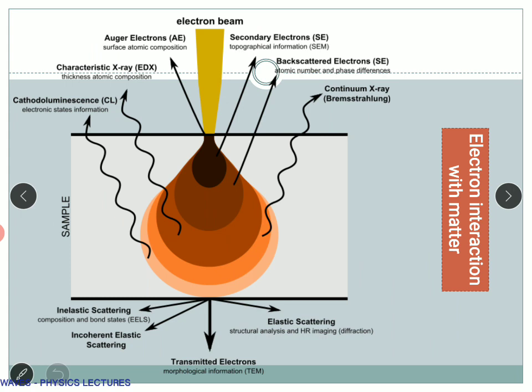Now this is another topic which we need to study, but for this we entirely need a complete lecture. So right now I am just going to tell you a basic idea here. What happens when an electron interacts with matter? We have studied the topic of interaction of electromagnetic radiation with matter, and when an electron interacts with matter, a number of processes come up.